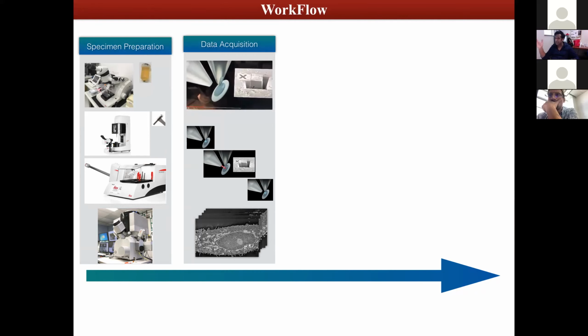Once you leave, the instrument has this great capability that it will shut itself off when it reaches that particular amount of data collection. Hopefully everything goes smooth. If you have set it up for 2000 images at this thickness, it will close the beam column and all the other parameters, instruments and detectors once it reaches the 2000 slices that you have asked it to do. That's the beauty of this instrument.